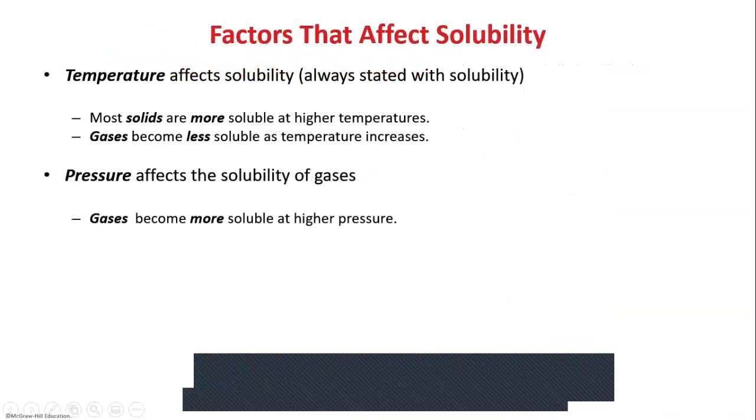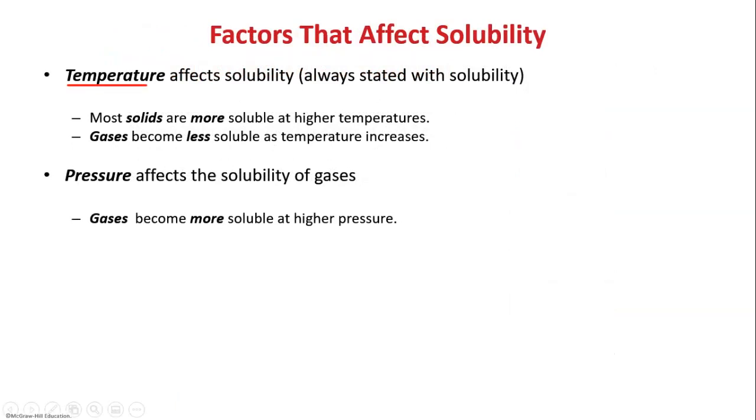So what are some factors that affect solubility? Well, these include just two things. Temperature affects solubility, and it's always stated with the solubility. So if you ever see solubility listed, it's going to generally give the temperature.